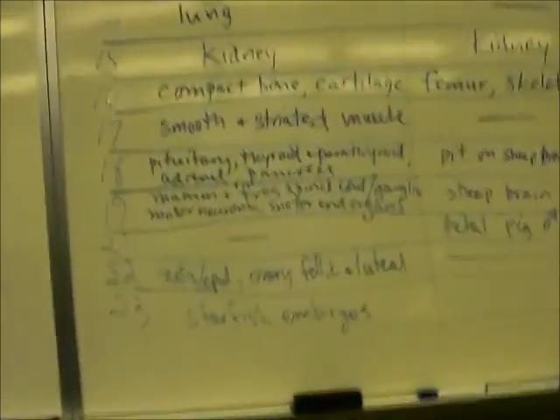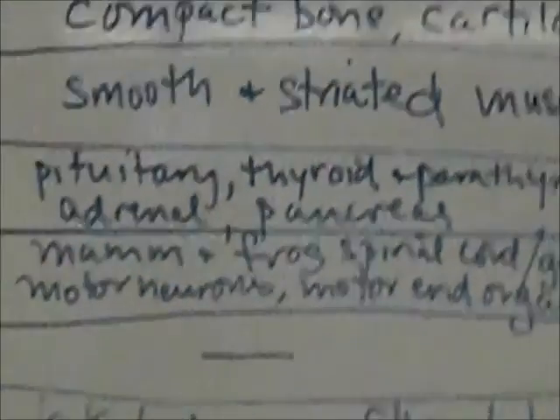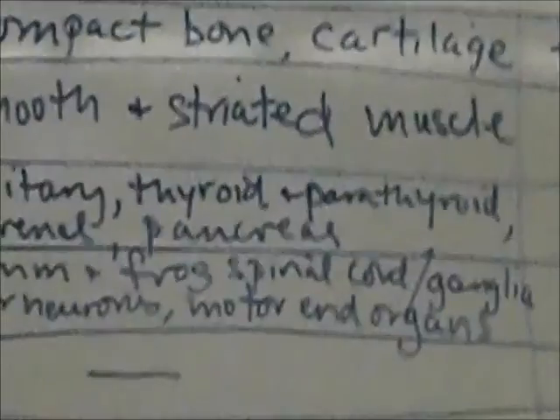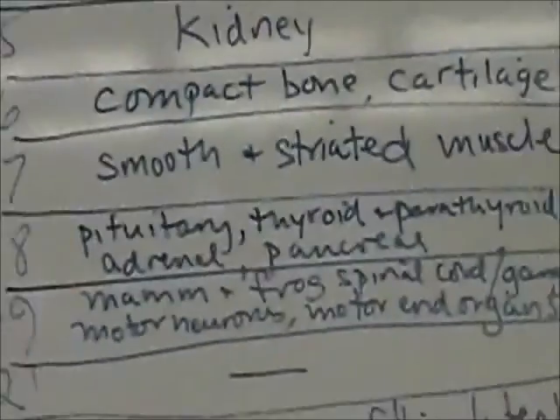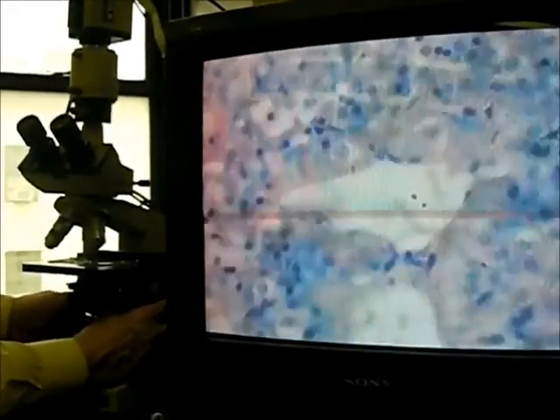And then the last two, adrenal and pancreas. Adrenal. Okay, the adrenal gland, you remember, like the pituitary, had a special stain. Remember those? You don't have to know the different zones, although they are pretty characteristic.